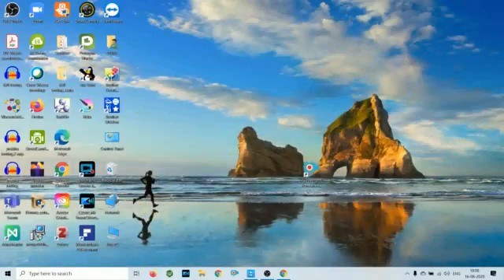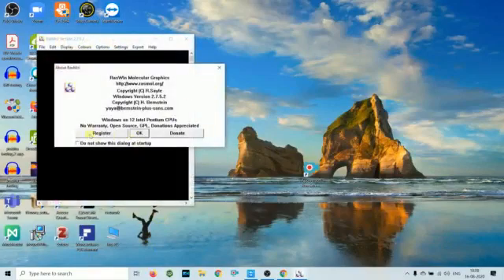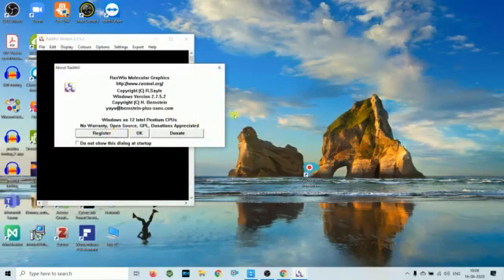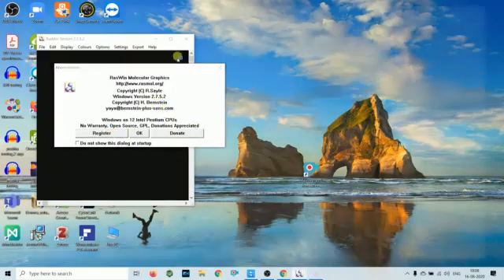Now it is installed. You have to open this icon. It will ask for registration. You can register.